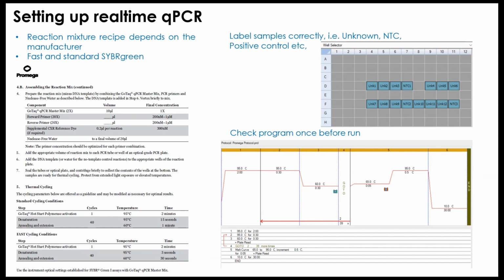So in a 20 microliter reaction, how much does it become? It is 20 times less than 10 micromolar, so it becomes 0.5 micromolar, which is in the suggested final concentration range of 200 nanomolar to 1 micromolar. So it becomes 500 nanomolar, for forward and reverse both.